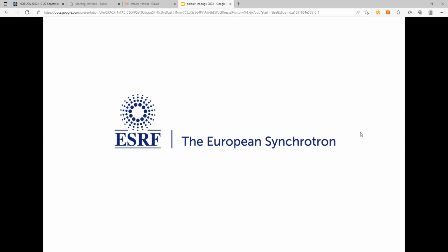We don't deploy containerization at all, actually. Each installation is unique for each beamline. So every beamline has its own install of the server and of the client. And if you want to access it remotely, we have a reverse proxy. So everything gets fed through the reverse proxy, and you can access it externally through that. Most of the load goes through the reverse proxy. We don't actually do that yet, but that's the intention.